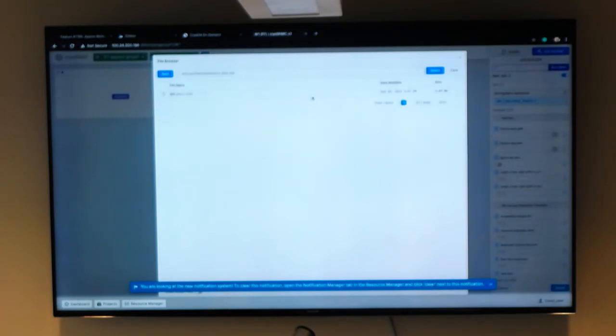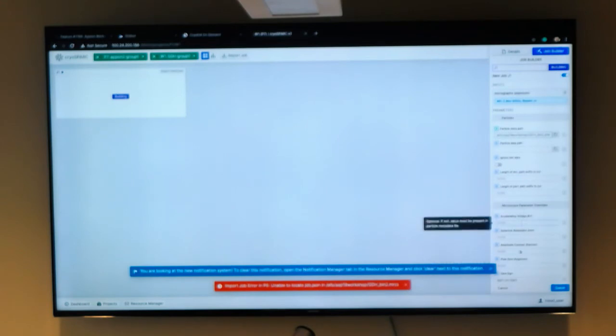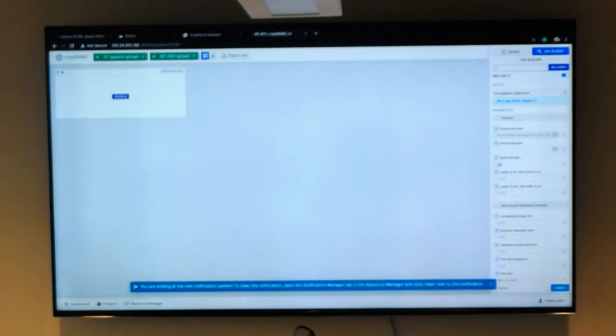We can select that and import that particle stack. In the metadata path, you would select the particular star file. You can skip all this because in our particular star file, all these parameters are located.